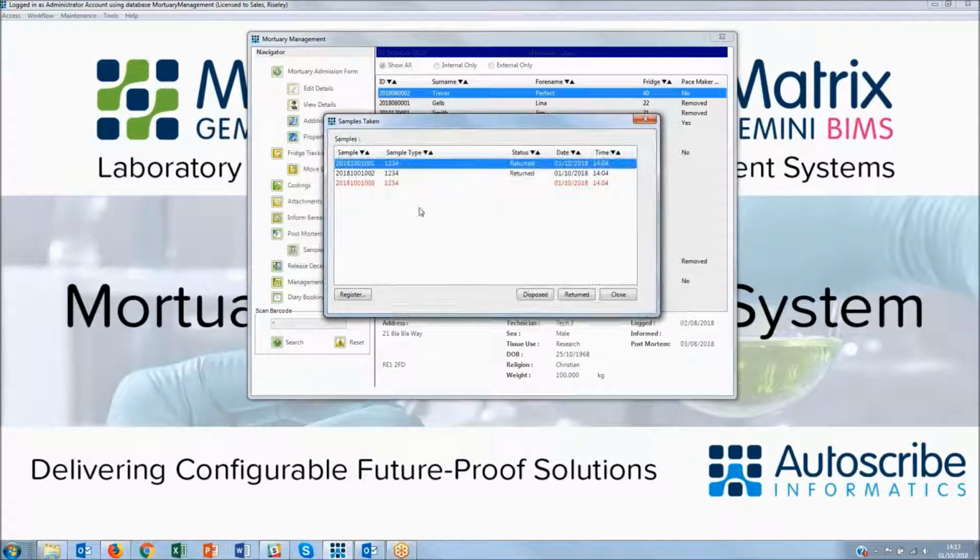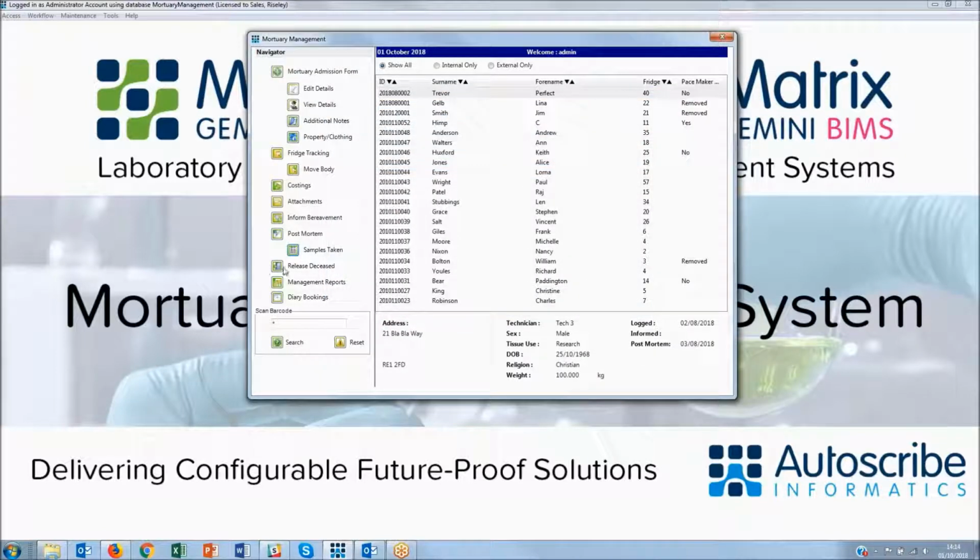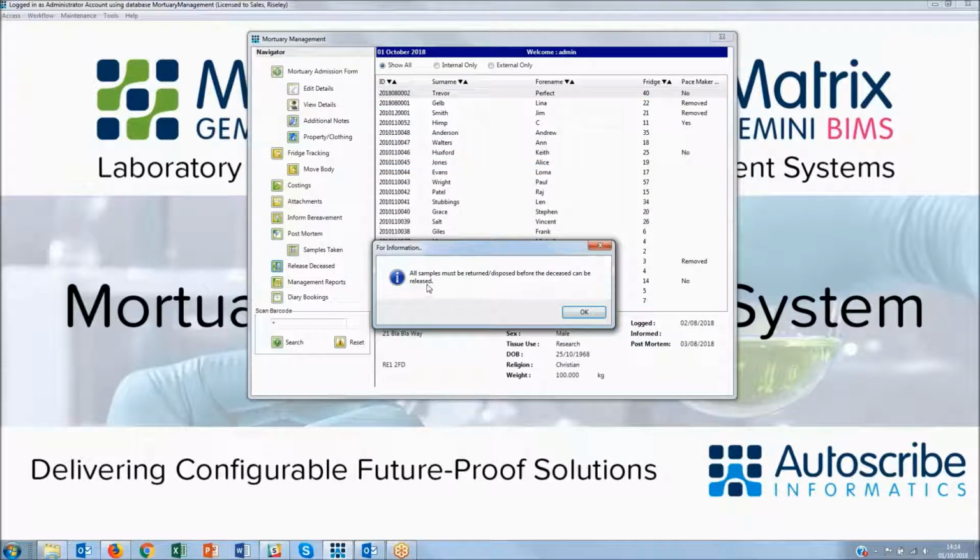You can make a note of what samples have been taken and what ones are being returned. In this case, there are 3 samples that have been taken and 2 have been returned. That's important because, in this case anyway, we need to return everything to the body before we release it. So if I try and release this body at this point, it'll say that samples have been taken and the deceased cannot be released yet.